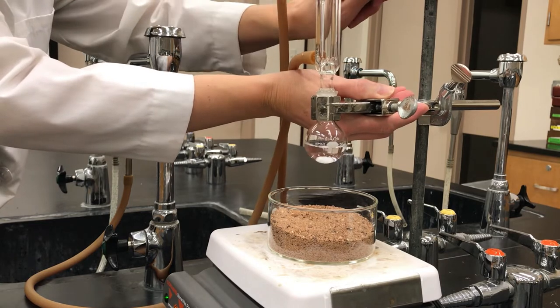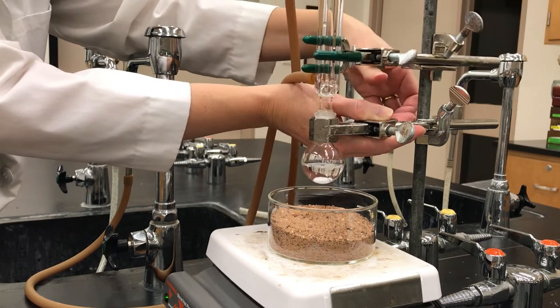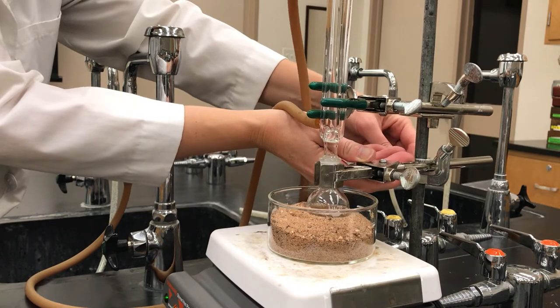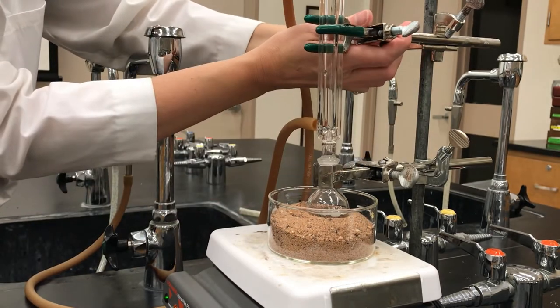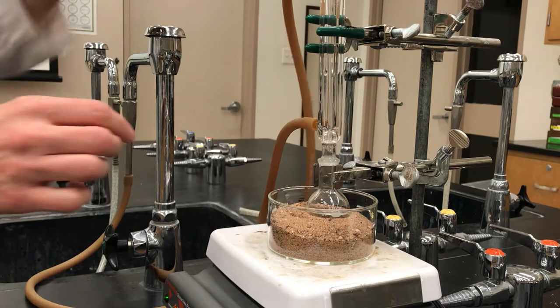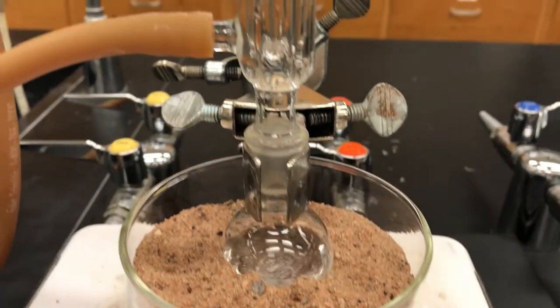And then loosen the clamps to lower the whole system into the sand bath. And once you've got the liquid submerged in the sand, then secure the clamps to make sure everything's tight. And I would give one more check, make sure that condenser is securely in there. So let's skip some time, and this is what it would look like when it has started refluxing.